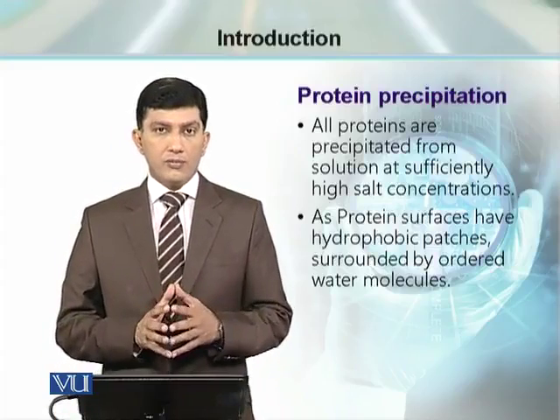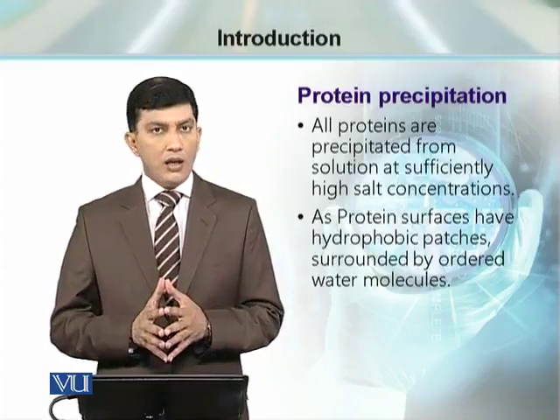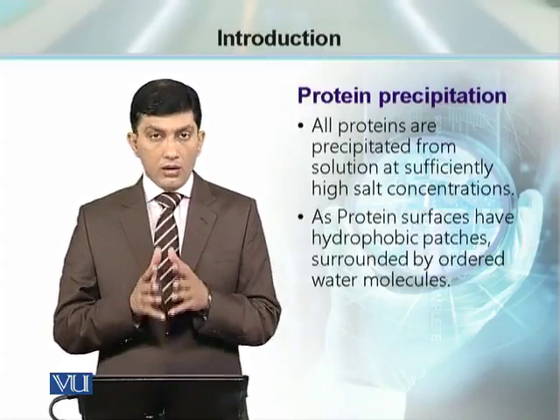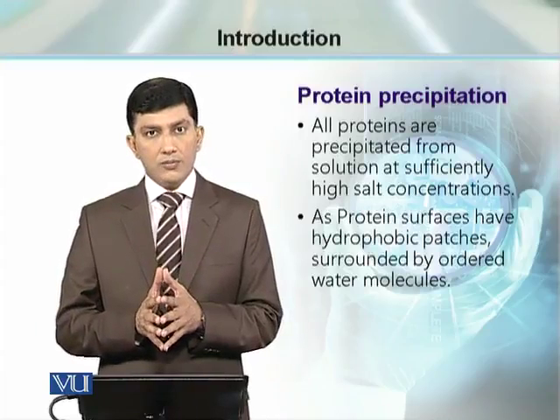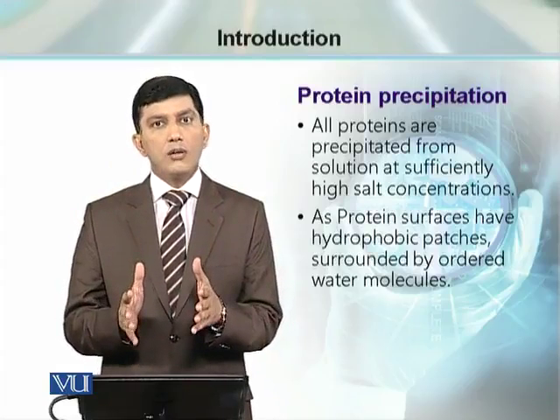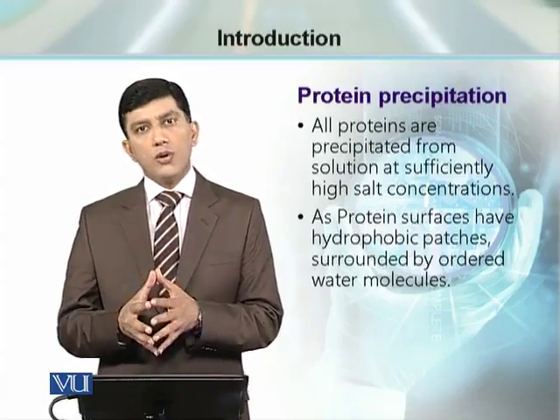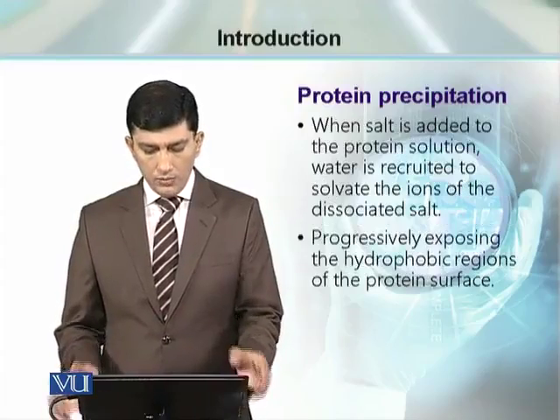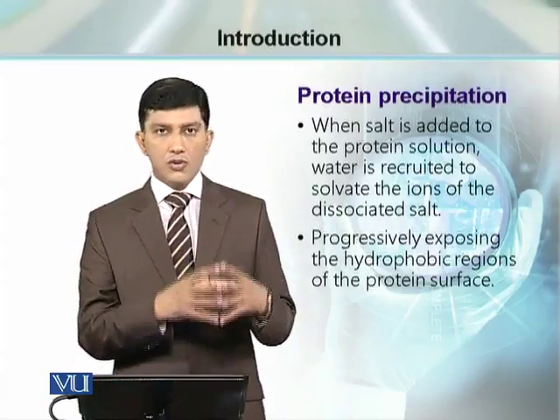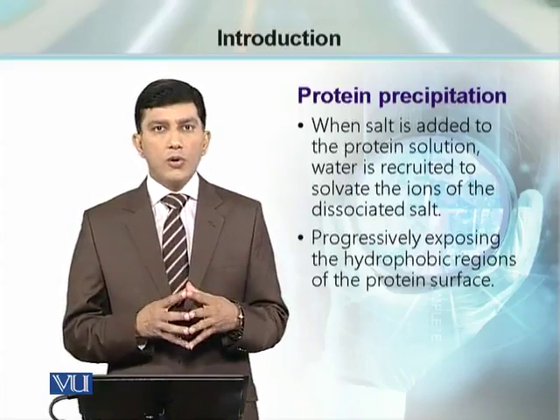What is the principle behind this? When we add high salt concentration, why do proteins precipitate? अगर proteins की structure को देखा जाए, proteins they are having the hydrophobic sites which are covered by the water molecules. A layer of water molecules is made around that particular protein, and when we add high concentrations of this salt, those water molecules are recruited to dissolve the salt so that the salt makes up the solution. During this process of solubility, salt is going to be dissolved by the water molecules.